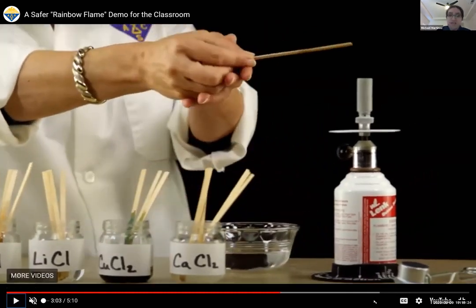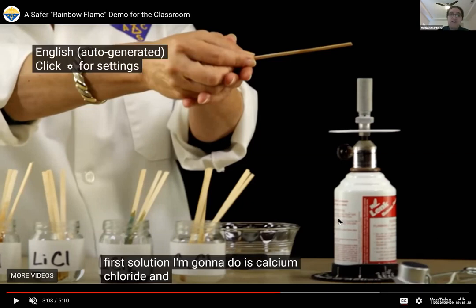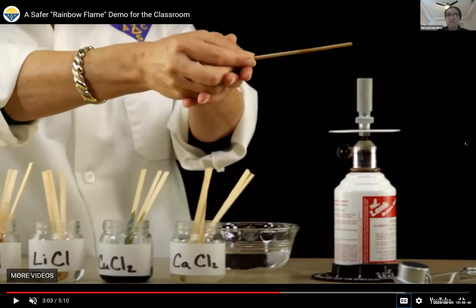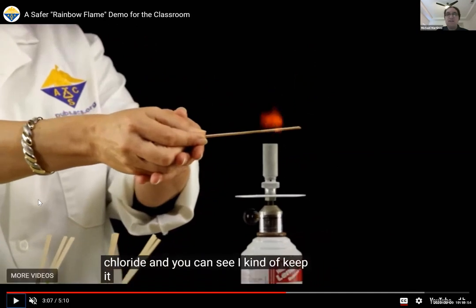So in the first part, you may want to turn on closed captioning. They're looking at calcium chloride, CaCl2, which you can also see from the picture. Now I just want you to watch what happens in the video. Just watch this first part together with me. What color do you see? What color do we see? Red. Red, yep, exactly. And that's what you're going to write down in your observations.